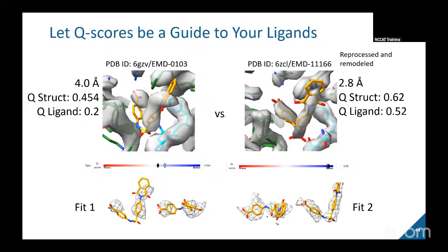You're talking about this way. So these two outcomes have different stereochemical geometries. This ligand underwent a major correction when we had higher resolution. So we could say that, as far as goodness of fit to data, it falls in the bottom quartile. I'm going to show this in a slide. I'm about to get into the distribution. So you definitely would not, for that class in that resolution bin, say that, based on all the instances in the archive, this is a very nice representation of what you can do with modeling at that level.